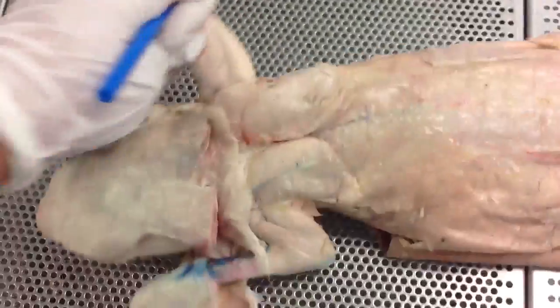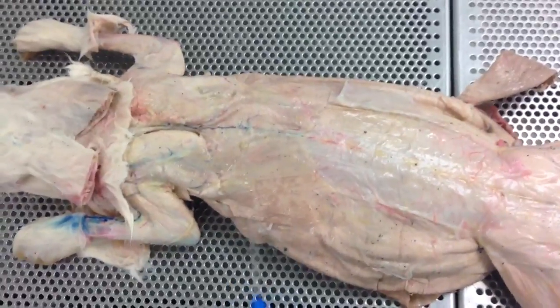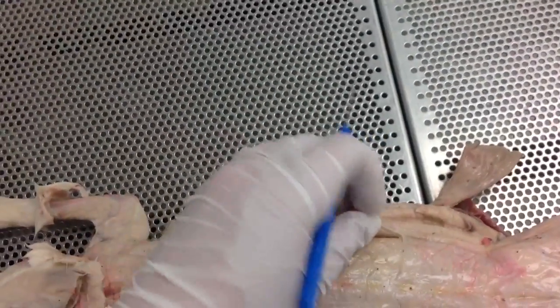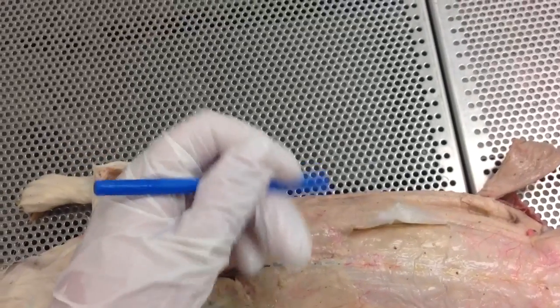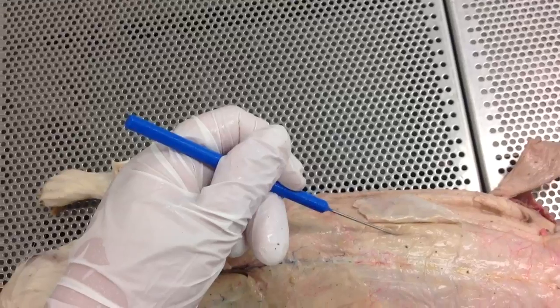Flipping him back over onto the dorsal side, we're going to do the trunk muscles that are superficial and deep. Over here you've got your latissimus dorsi. This flap of skin right there is going to be your lumbodorsal fascia. Underneath, if you flip it up, this layer right here is going to be your multifidus.